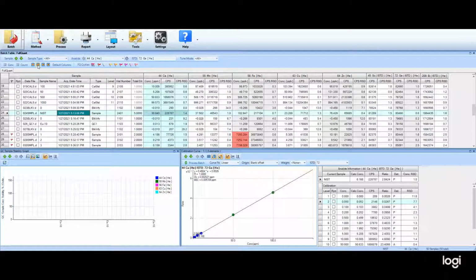There are 4 user settings that can be defined. This one happens to be user setting 1, and what I have set for user setting 1 is everything that we export as raw data. It has all the necessary information that can be important later on if we look at data and want to reanalyze them.